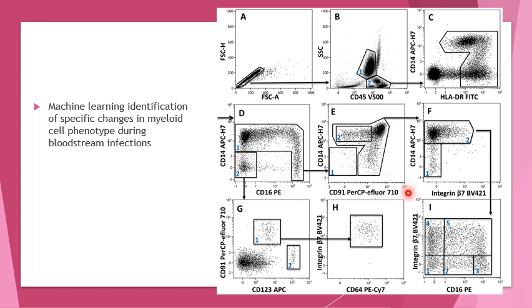Going back here, they used their double negative monocyte gates probably to identify their dendritic cells, which we can kind of see CD123 and CD91. Our double positive, or just our positives, CD91 they used here, and then they did gate out their CD123. That was just probably another value that they obtained.